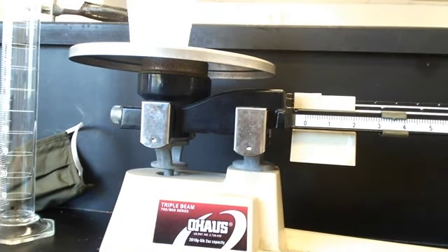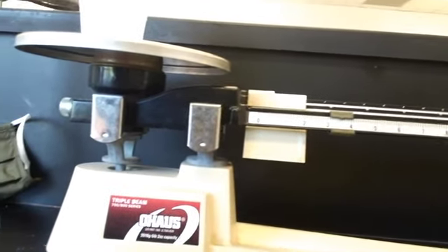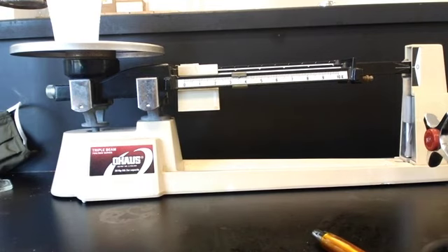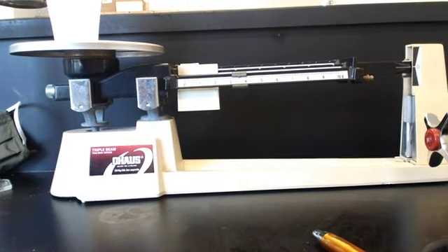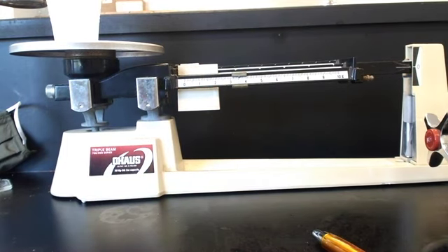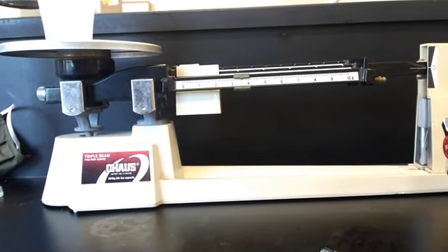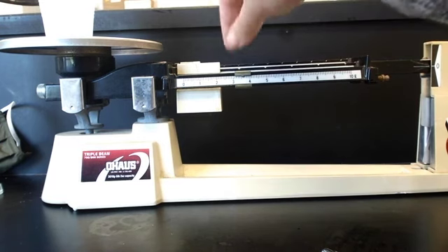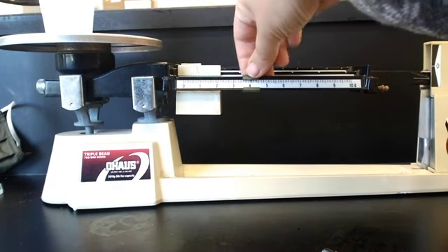Hold on just a second while I readjust here. 3.6, sorry. Okay. 3.6 is about right. Let me focus this again so you can see it better. Let's see if we can get a little bit closer. So now what I'm going to do is set this to 4.6, because that would be 1 gram over.